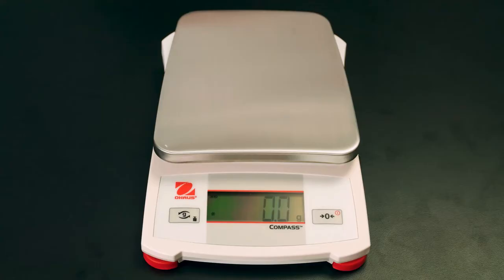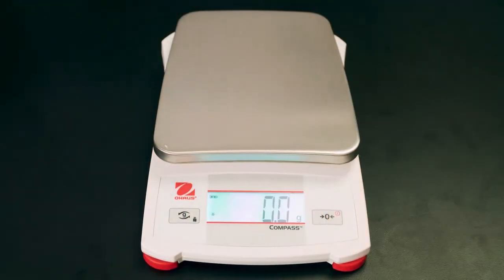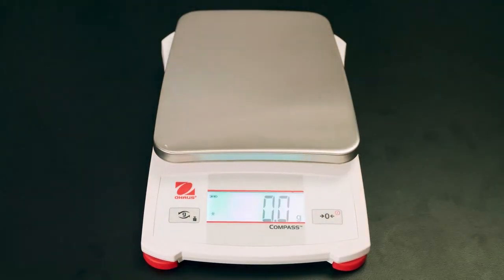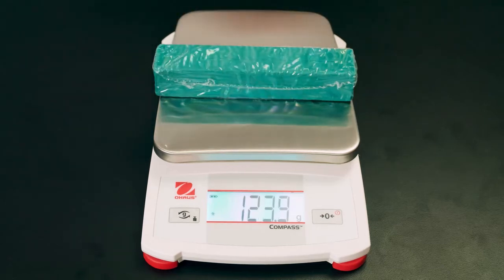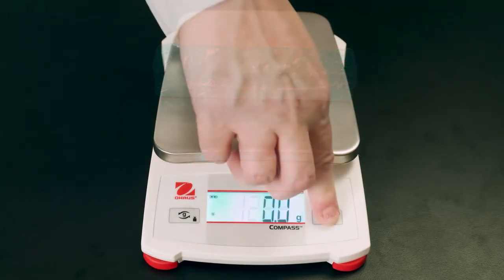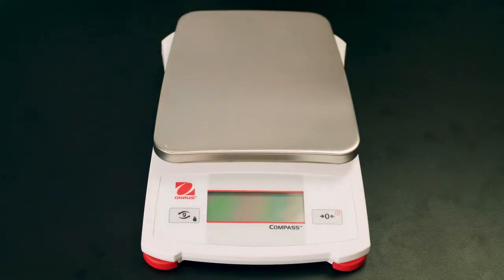Examine the scale and make sure that the units displayed are grams. Many scales have a variety of units that can be measured, allowing you to select the units desired. If the units displayed are in grams and you are measuring in grams, then you're ready to begin. Press the tare or 0 button on the scale. Wait until your scale reads 0 grams. This ensures that the scale is set to 0. Once the scale reads 0 grams, place your object on the scale in the center of the pan. Read the number displayed. This is your mass. In this case, it is 123.9 grams. After you've completed taking measurements with the balance, turn it off.